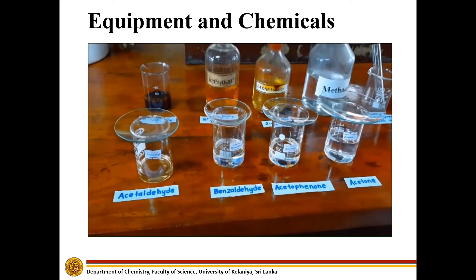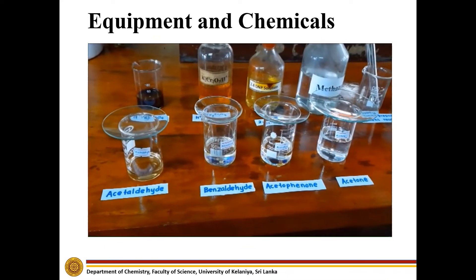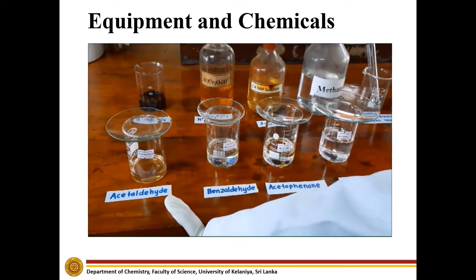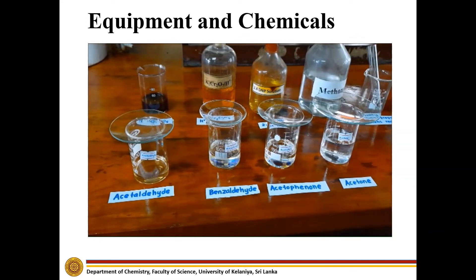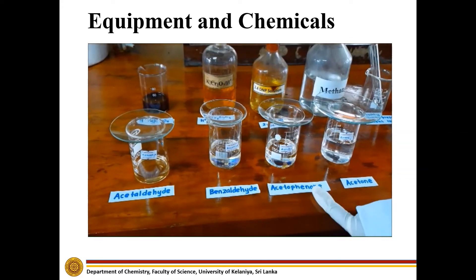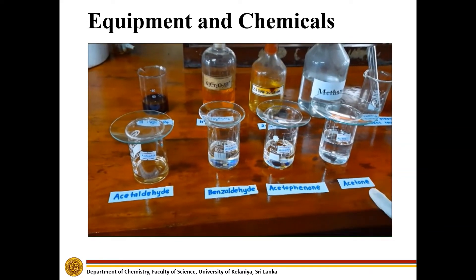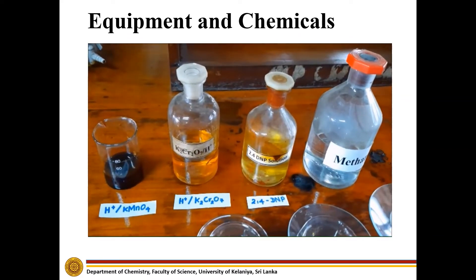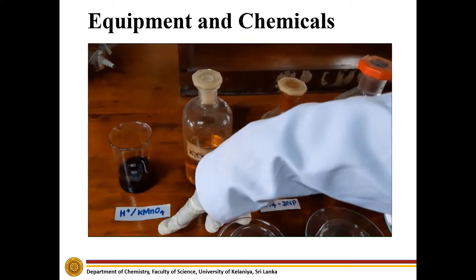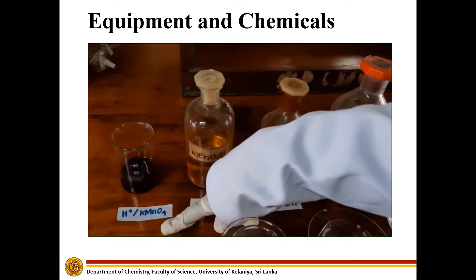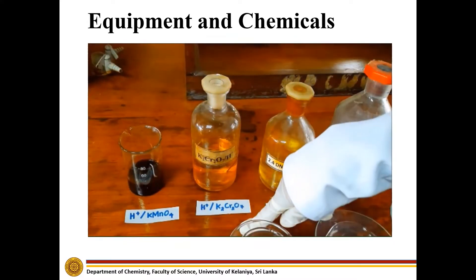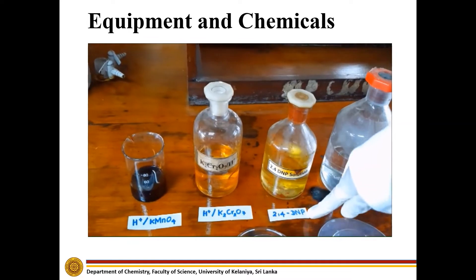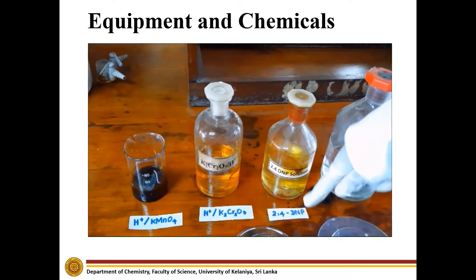For this experiment we use acetaldehyde and benzaldehyde as aldehydes, and acetophenone and acetone as ketones. As the other chemicals we use acidic potassium permanganate, acidic potassium dichromate, and 2,4 DNP.